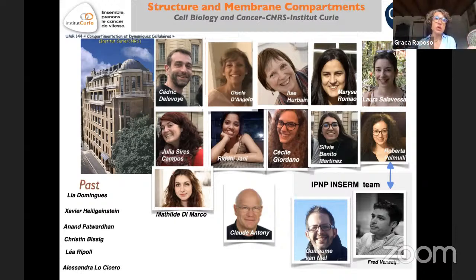And then, of course, when you are doing the localization of your components, you first have to ask: do I have antibodies? Are my antibodies working for EM? Because a lot of antibodies work for immunofluorescence, but that doesn't mean they are going to work for EM.